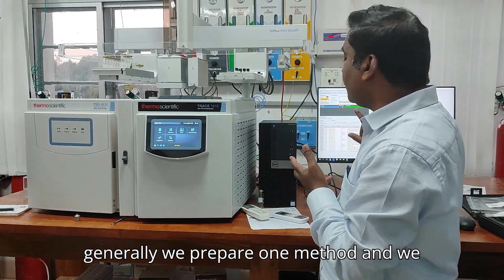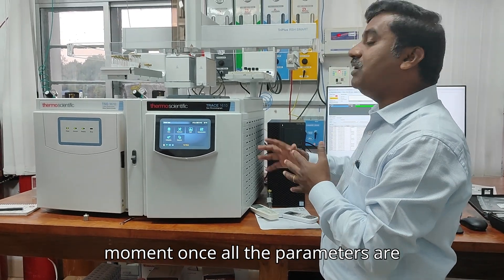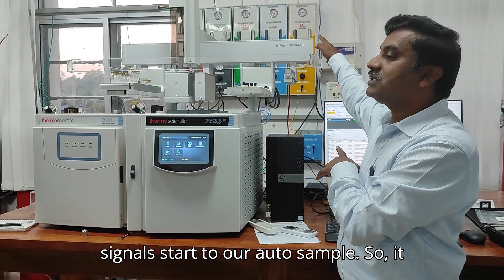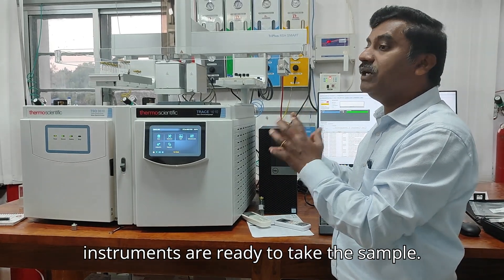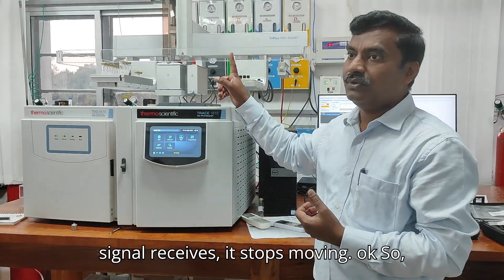Generally, we prepare one method and transfer it to your instrument. Once all the parameters are attained on the software, the signal starts to work the autosampler. It is configured in such a way that once all instruments are ready to take the sample, it receives the signal. Once the signal is received, it starts moving.